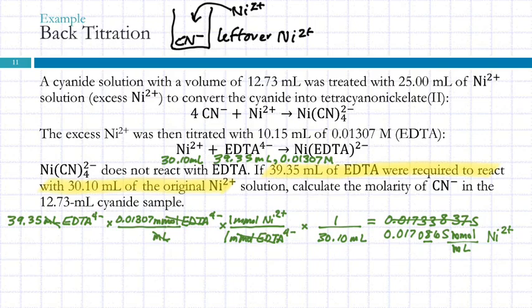The stockroom person made a mistake, but the person had documented what they wrote down, and so we were able to look at the calculation and realize that the molar mass for carbon was used instead of the molar mass for calcium, which means that the solution was completely the wrong concentration and the experiment didn't work. But we knew why, and so that's a good thing, because then you can fix it, right?